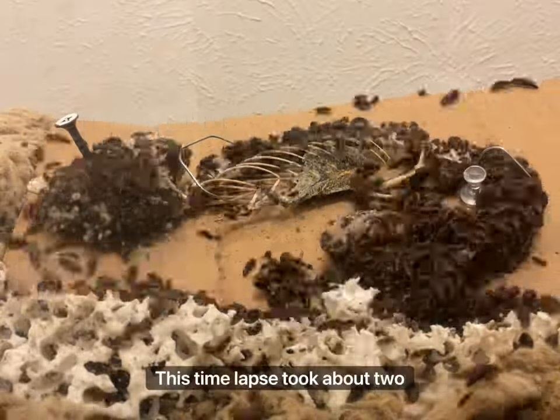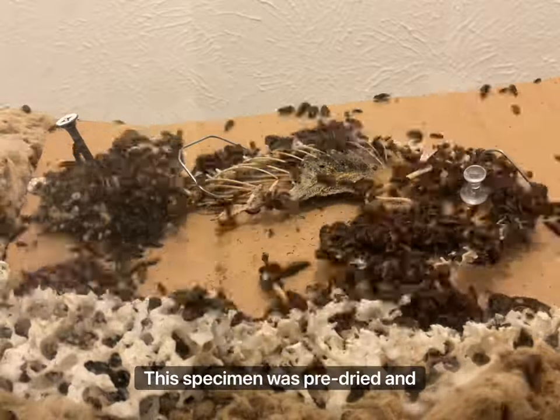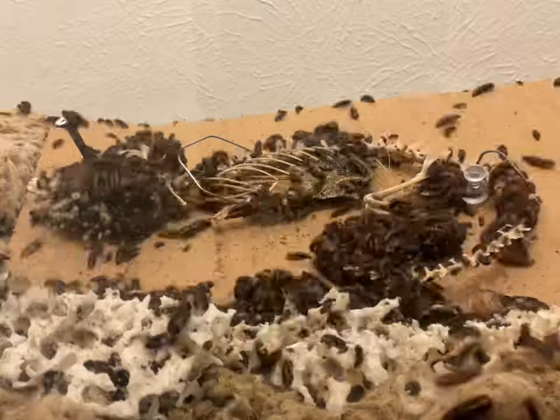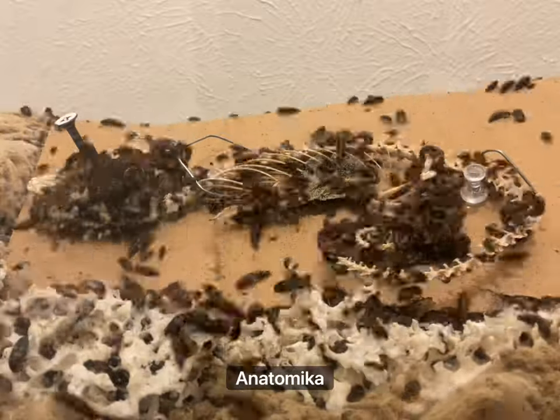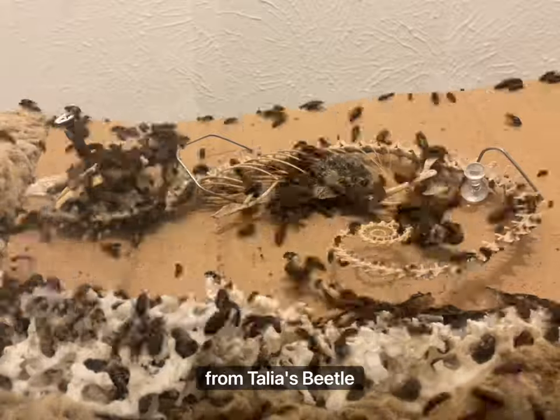This time-lapse took about two days to complete. This specimen was pre-dried and had all the organs removed prior. I cleaned this specimen for anatomical science, and for those interested, I got my dermestid beetle colony from Talia's Beetle Bugs.